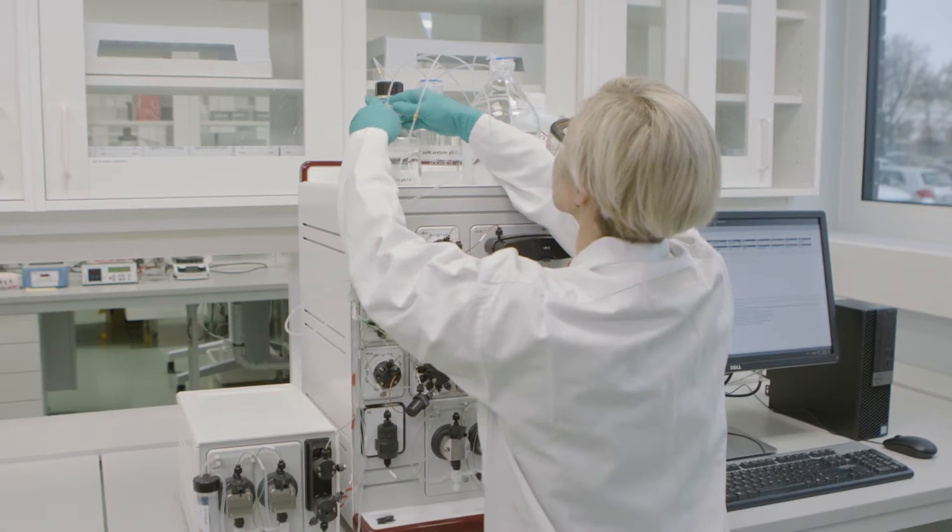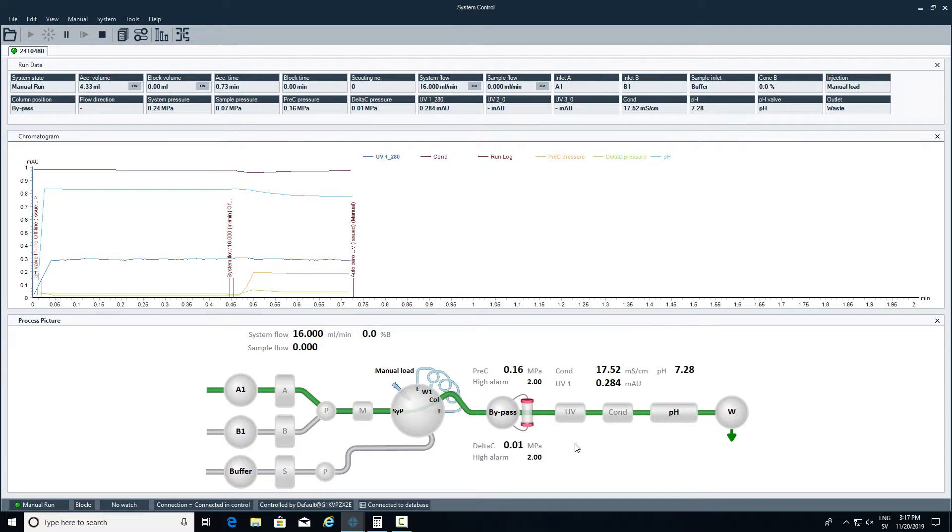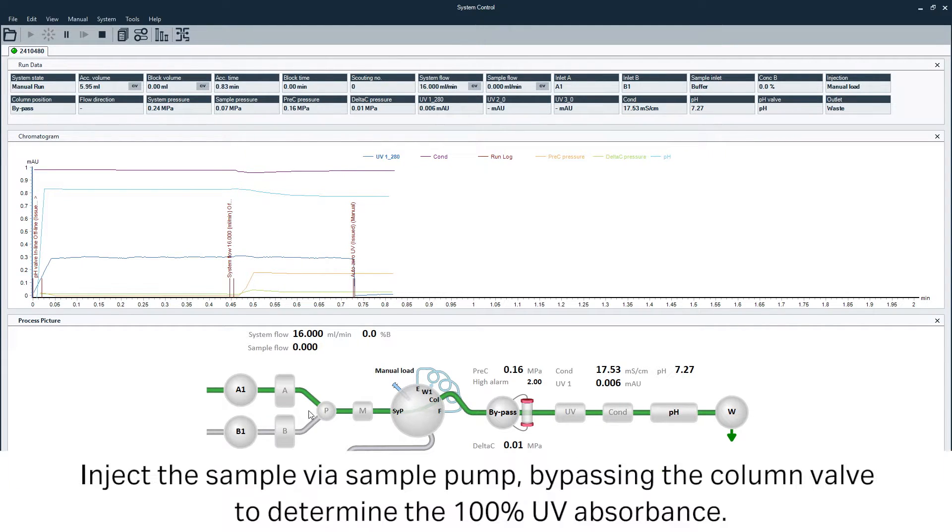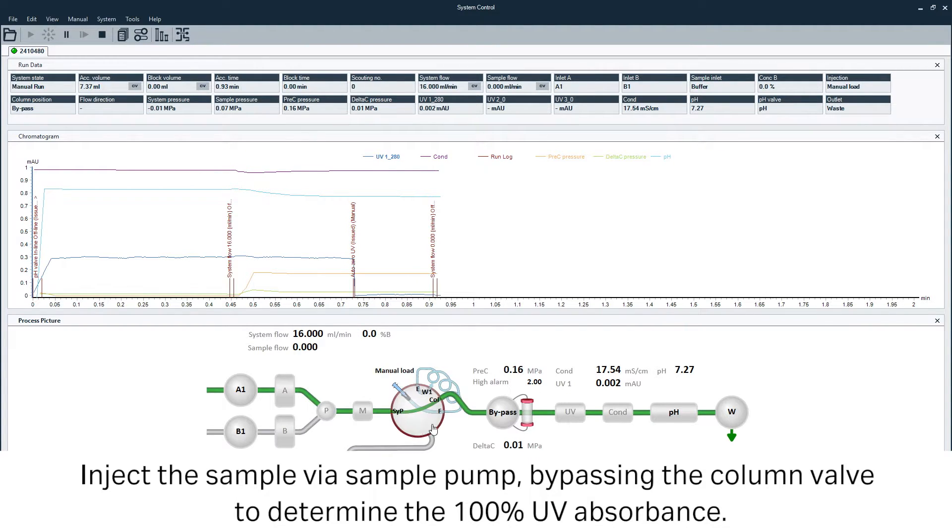Before starting the frontal analysis, inject the sample to bypass the column valve and determine the 100 percent UV absorbance at 280 nanometers.